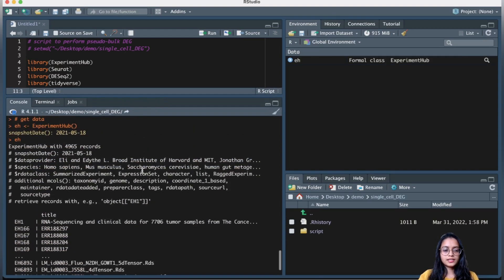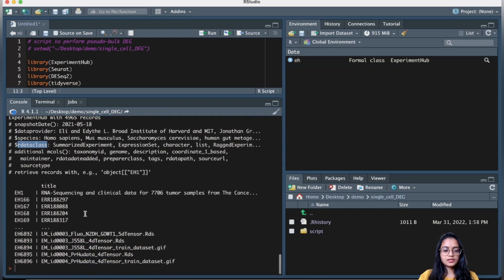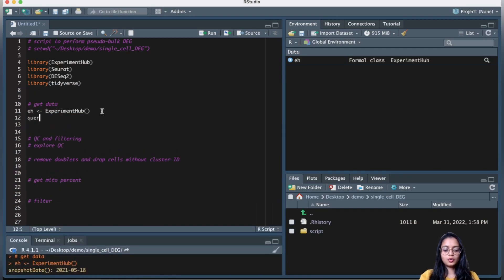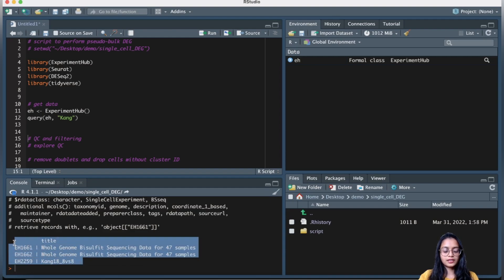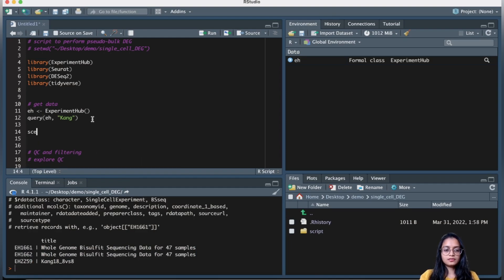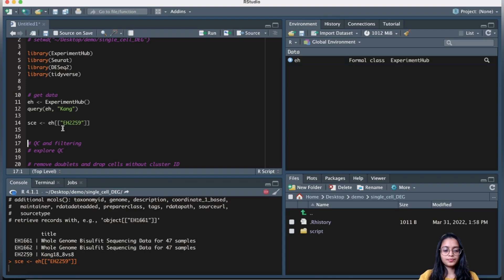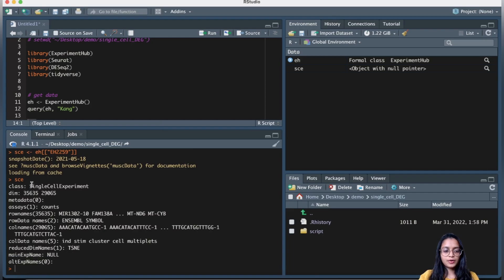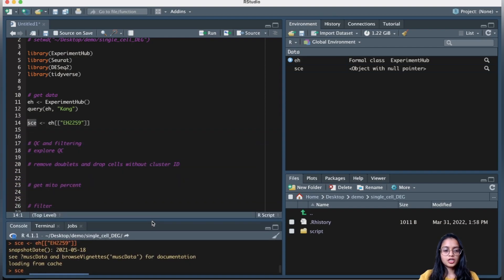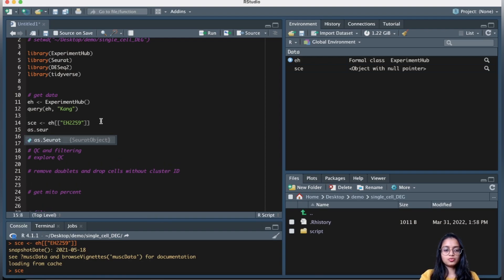The ExperimentHub object will tell you what data it has — the provider, species, data class, and all of that information. Let's query the object for the Kang data. When I run this, I get information on all the data associated with Kang. I'm interested in a specific dataset, so I'll get that data using the accession ID. This is a SingleCellExperiment class object, but I want it as a Seurat object, so let's convert it.